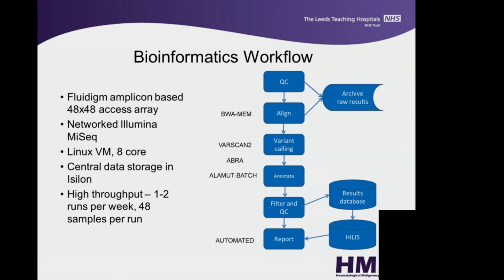As I said before, high throughput, we can do 1 or 2 runs, or we could even do 3 runs a week on a single MiSeq. So again, you've got the capability of doing 150 samples per week.